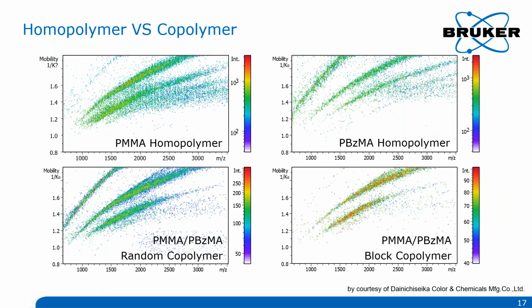This type of analysis can be used for quality control applications, almost like thin layer chromatography or TLC. Specialized software can compare these heat maps statistically to identify acceptable and unacceptable patterns.